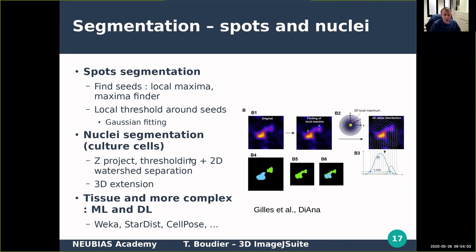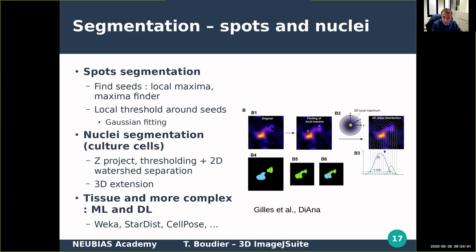For spot segmentation, we detect seeds using local maxima and then draw a profile of decreasing fluorescence around each seed — this should be approximately Gaussian. We fit a Gaussian and find a threshold based on it. Depending on each object, the local fluorescence decay creates a different local threshold around the seed. For nuclear segmentation, the approach is to project the 3D image to a 2D plane, do segmentation and separation in 2D, and then extend the segmentation back to 3D.